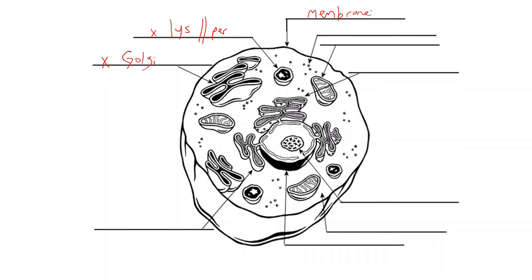All right, the little dots, that's the next structure. I only know that they're ribosomes because I see them glued on to other structures like right here. So remember, we talked about ribosomes don't have to be glued on. They could be freely floating in the cytoplasm. But regardless of whether they're attached to an ER or freely floating, they're going to be creating proteins. The next structure around the clock looks like a jelly bean, and there's some better ones. I don't know why they picked that one to point at, but there's three of them in this image. They kind of look like a jelly bean with some wiggles in the middle. And of course, this is mitochondrion. I'm just going to label it MT for short. And we know that those are all about making ATP.